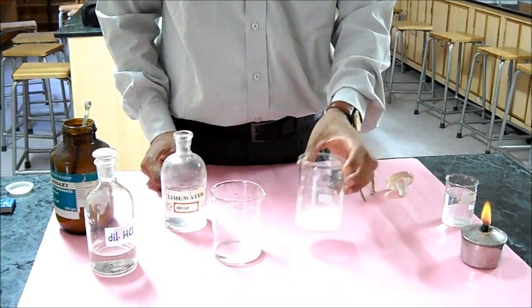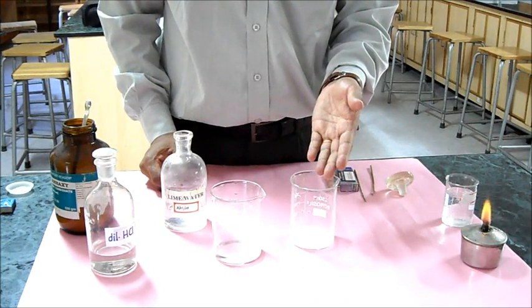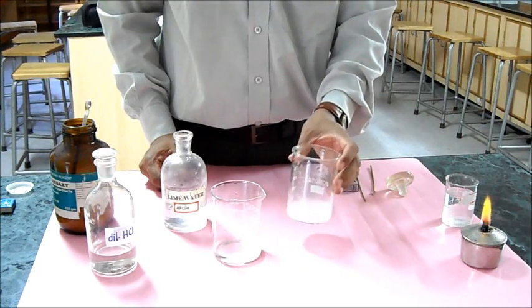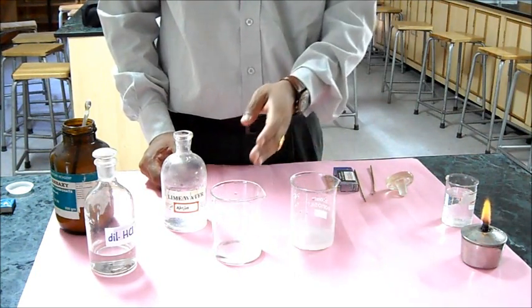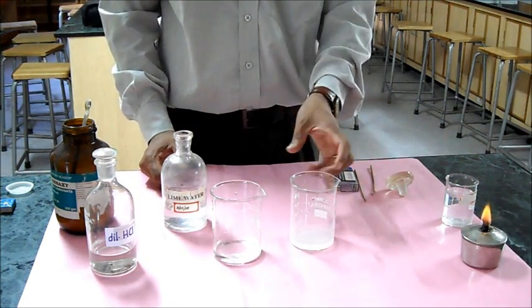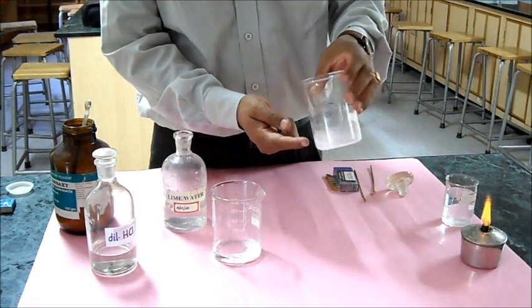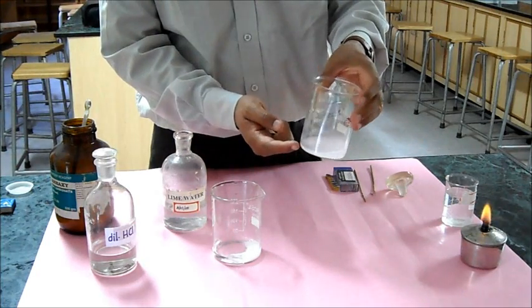It reacts with lime water. This is another neutralization reaction where lime water is a base and the gas is acidic. Because of that, it turns into a white precipitate which changes the color of the lime water.